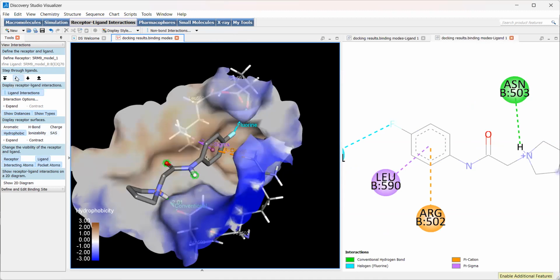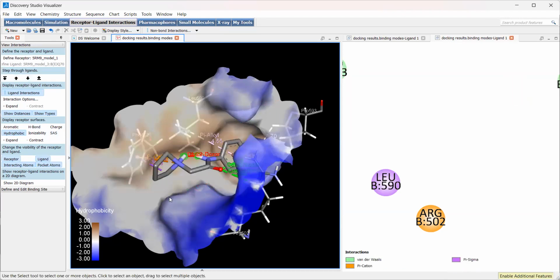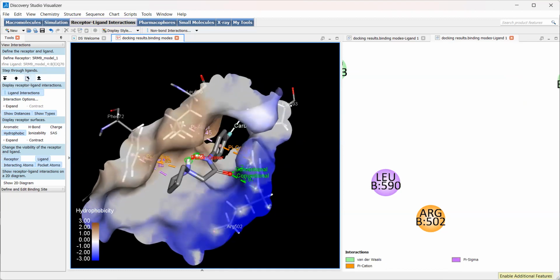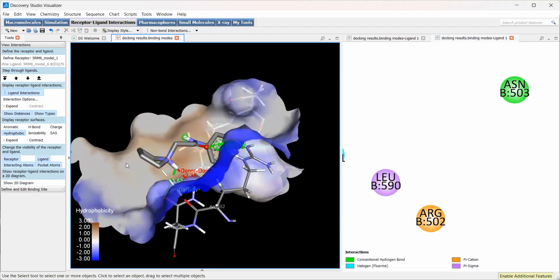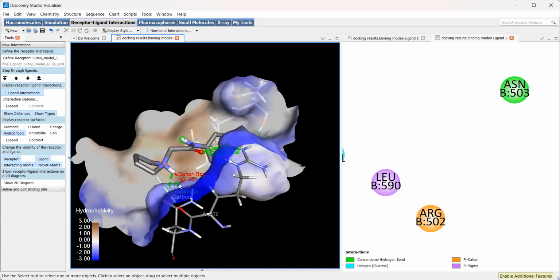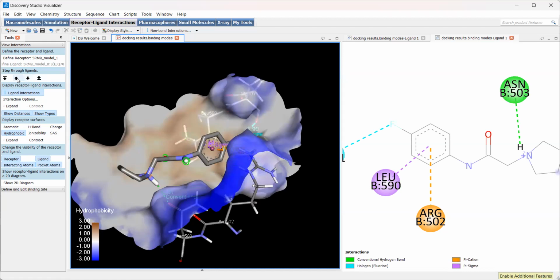We've compared the binding scores, and we have looked at the specific interactions, both with the crystallized fragment and with other binding modes. And looking at those other binding modes gives us information about how we could potentially use some structure-based drug design.